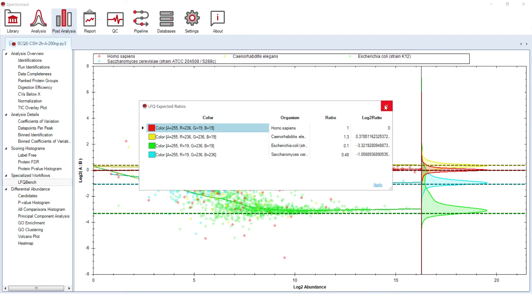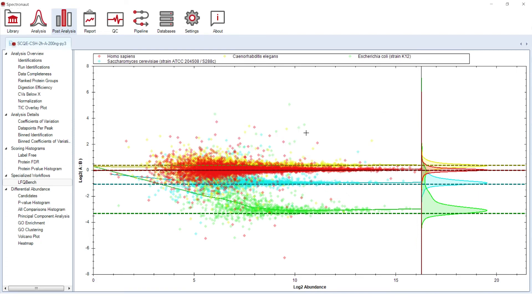Finally, all the proteins that are differentially regulated between the two experimental conditions can be found in the candidates list and the related volcano plot.